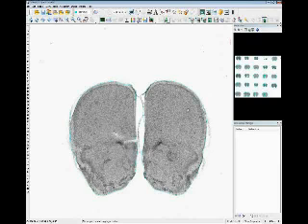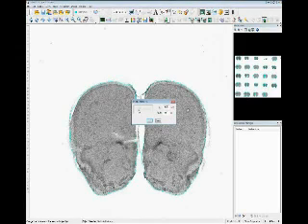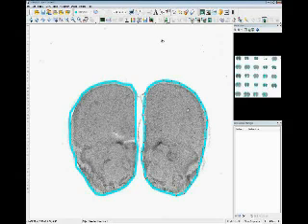So let's adjust the thickness so that it's easier for everybody to see. I'm going to go to Select All Objects, Modify Thickness, and just make it a little bit fatter so it's easier for everybody to see. I'm going to take this opportunity to show you some other stuff as well.